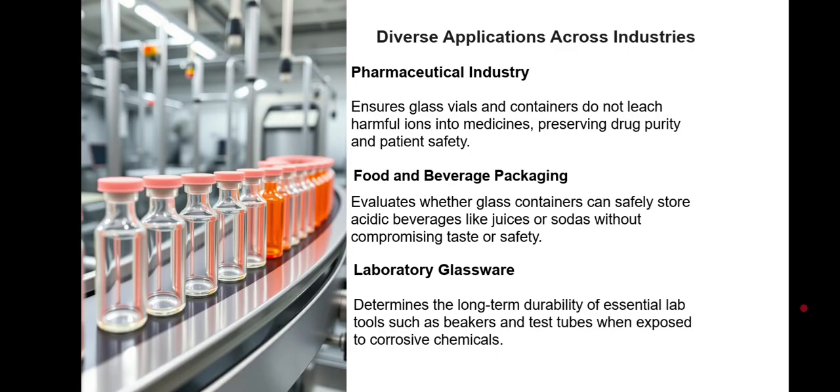And then the acid exposure. Expose the samples to acid: immerse them in 100 ml of 1N HCl or H2SO4, heat the solution to about 95 degrees Celsius, near boiling, and maintain it for 3 to 6 hours. Why high temperature? Because it accelerates the reaction, simulating long-term exposure in a shorter time. This step is where the ion exchange and leaching happens. This method is more detailed. For example, if you find a high concentration of Na+, it means the glass has poor resistance to acid attack.